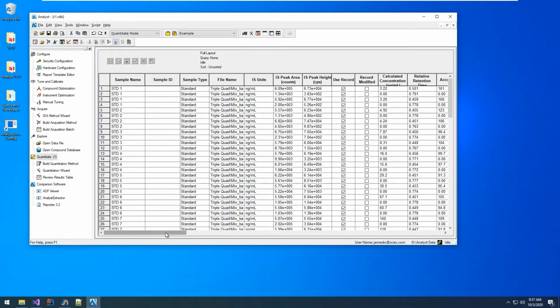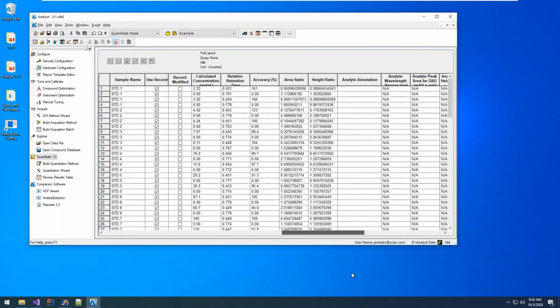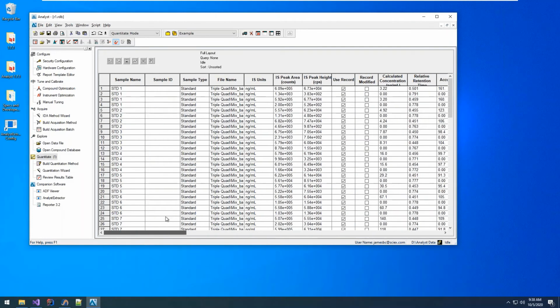This tabular view is flattened, and so we're seeing some information duplicated. For instance, the sample name is the same for all of the analytes for the sample. So one row here is a single analyte in a single sample. There's quite a lot of data here, and this view doesn't even include all of it. Some of it's not available through the UI.